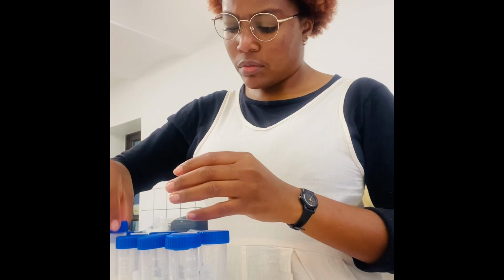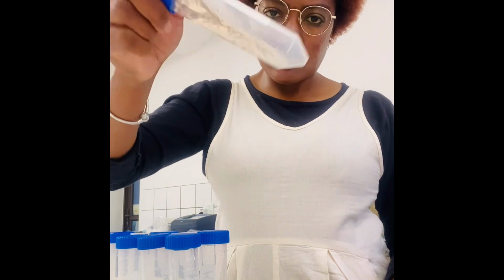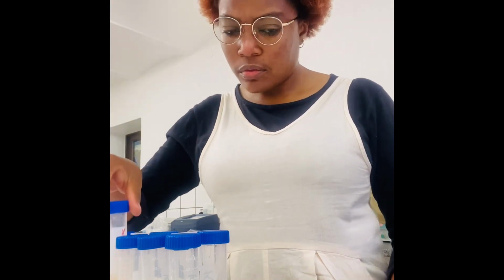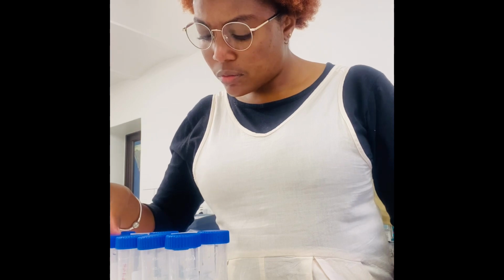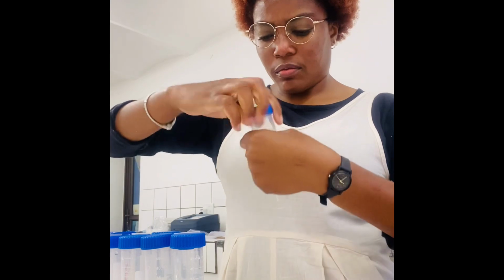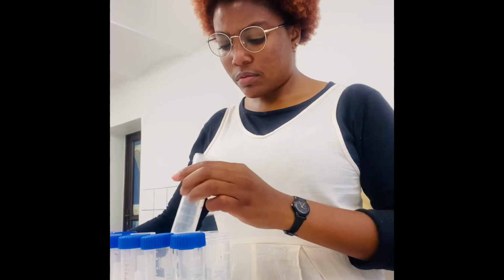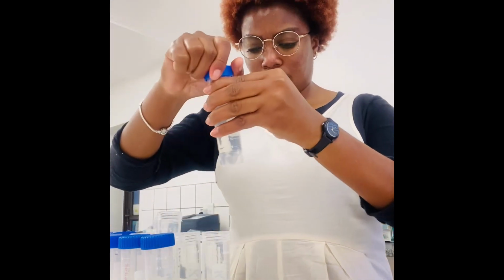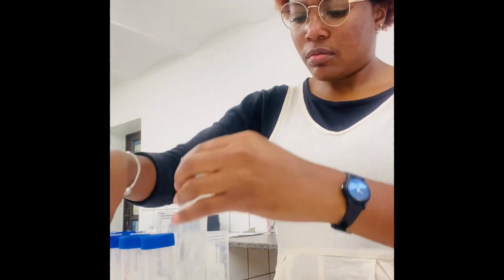And they also have a time, for example phosphorus is quite sensitive. You quickly have to put the powder into the container, quickly close it, shake it vigorously, but not too vigorously, because it will become too blue. Then it will look like there is so much phosphate in the water. So you have to maneuver it properly so that it doesn't become too blue. And also if the time is up, it needs to be analyzed, otherwise the reaction will keep happening and it will look like there is so much phosphate.